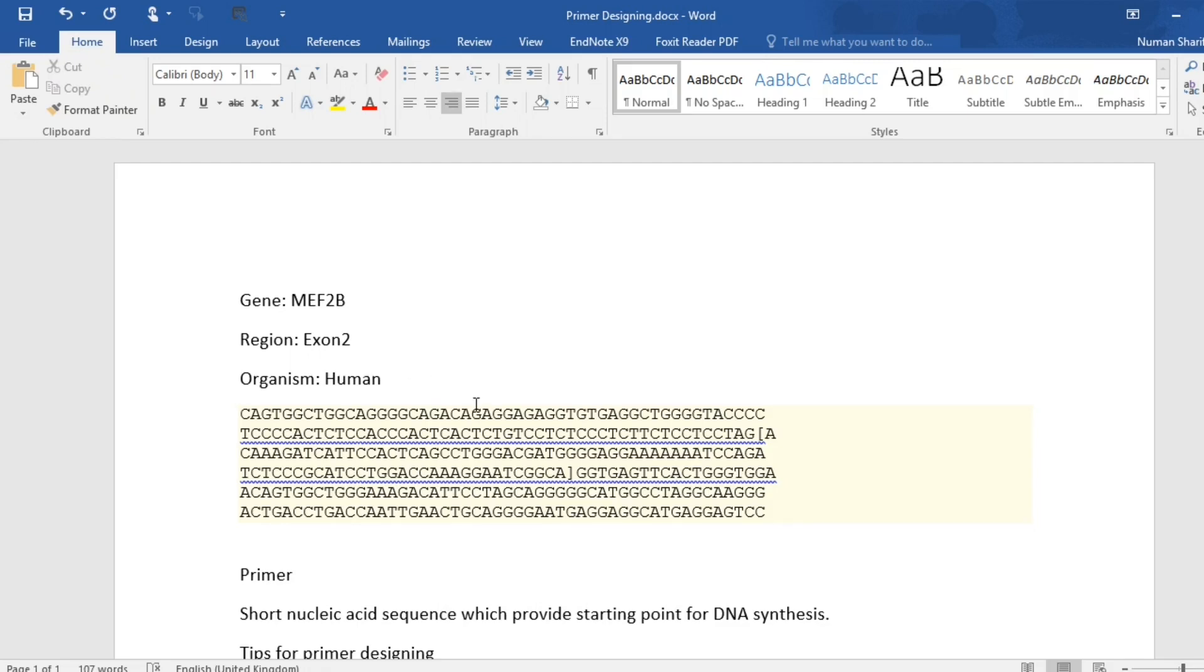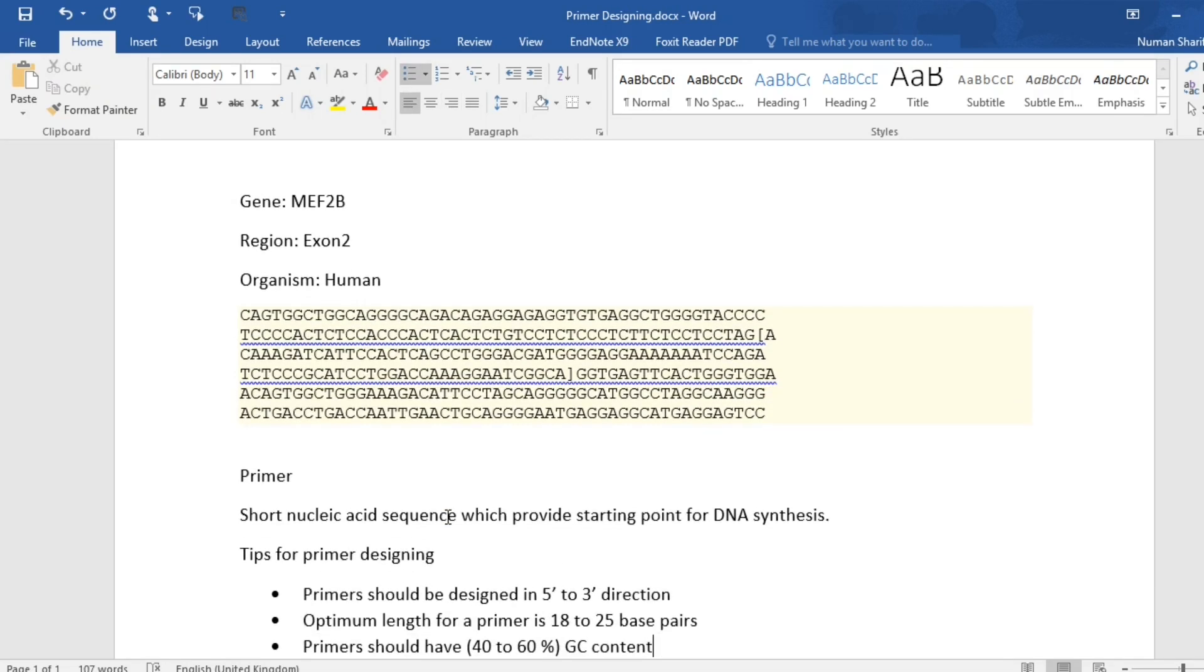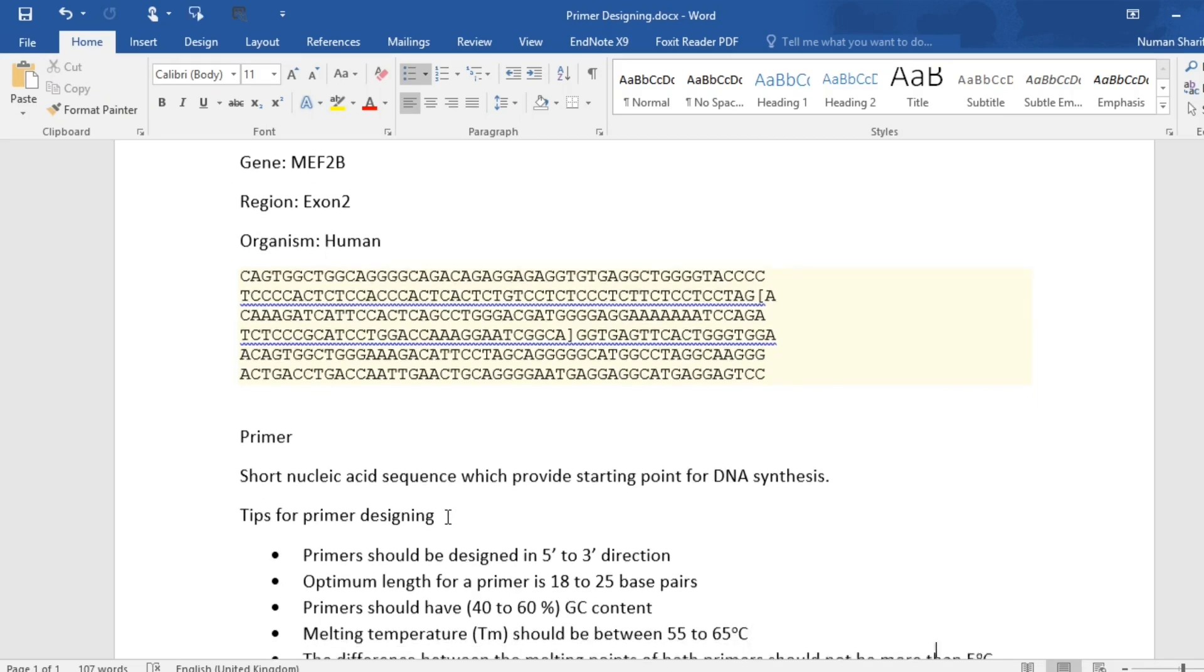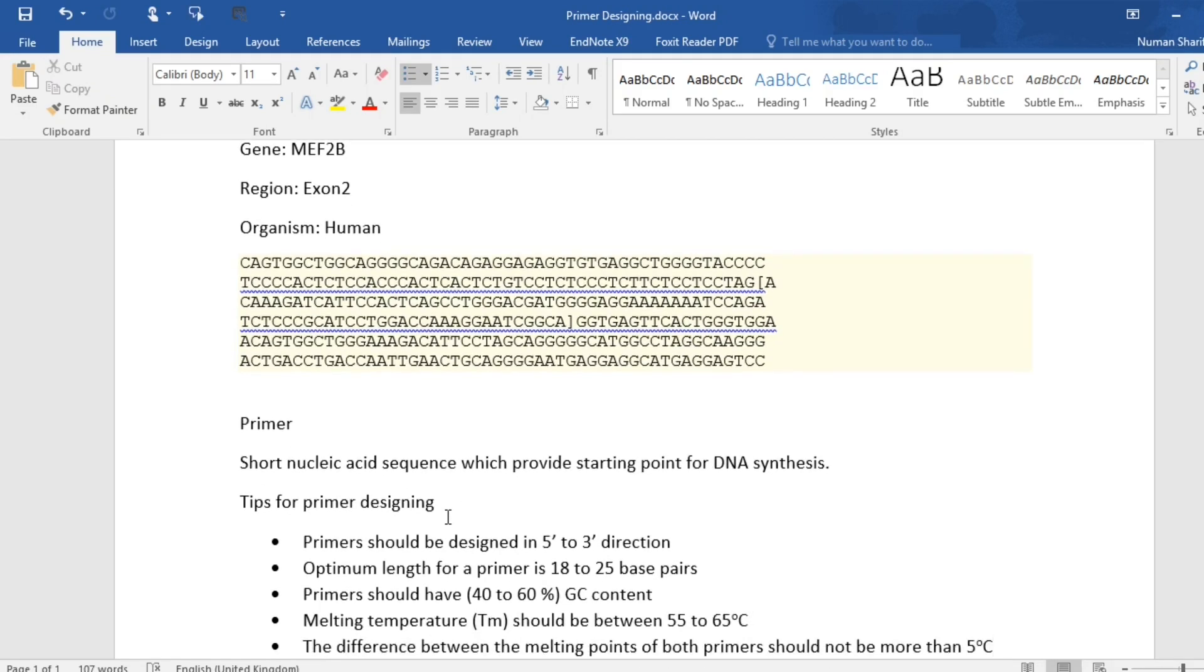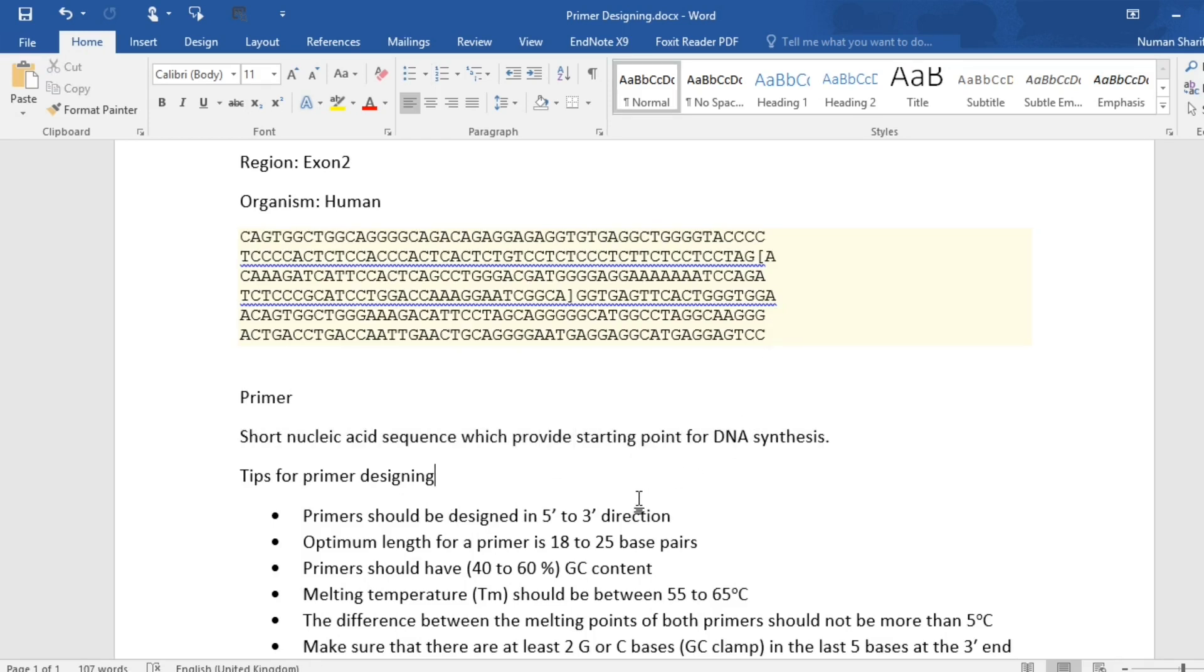Primers are short nucleic acid sequences which provide starting point for DNA synthesis. Primers should always be designed in 5 to 3 prime direction.